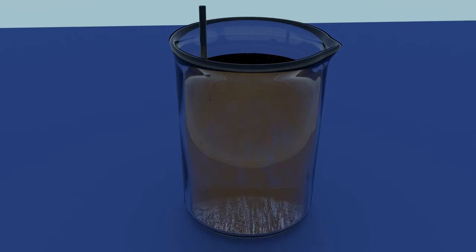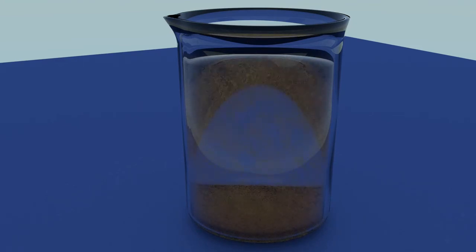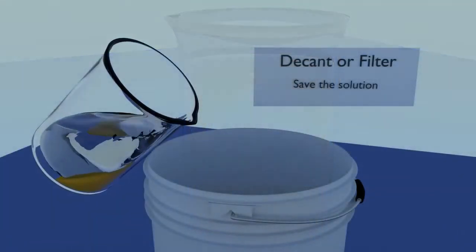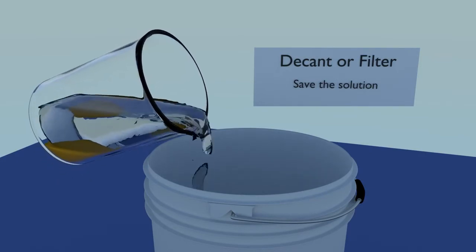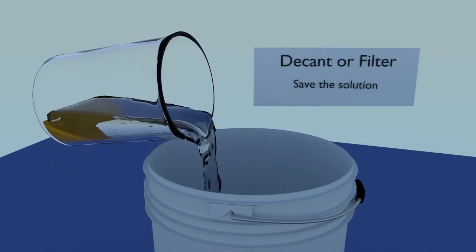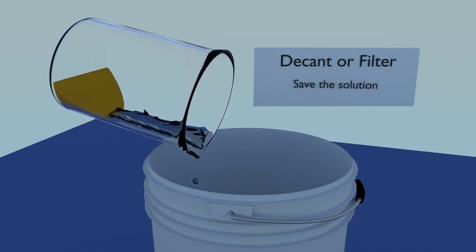Give the water a good stir with a clean plastic or glass stirring rod. The gold particles will settle within a minute or two. If sodium metabisulfite was employed or the particles are tiny for some other reason, it may take a little longer. Once the particles have settled, decant or filter the water and then rinse again with water. Two rinses is usually enough, but we'll test to make sure.